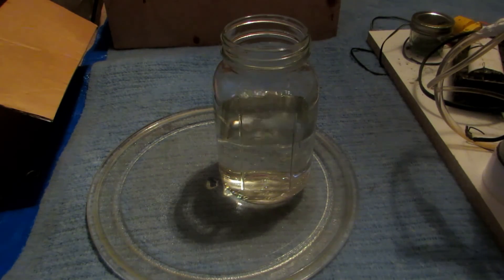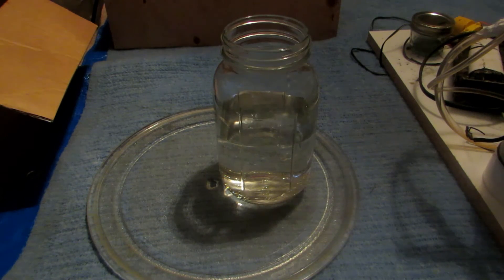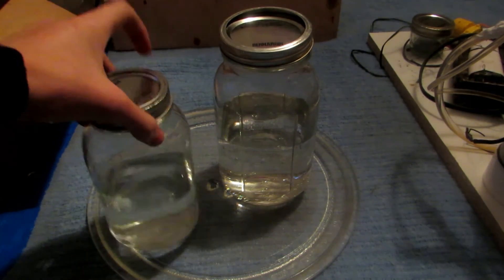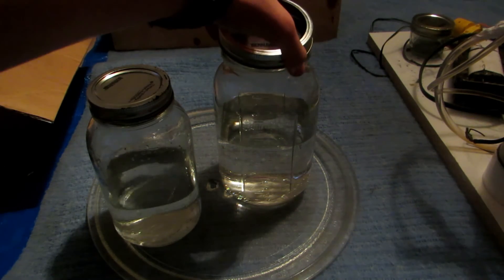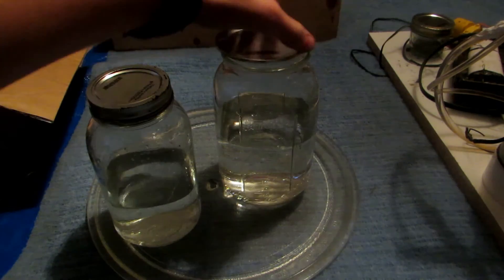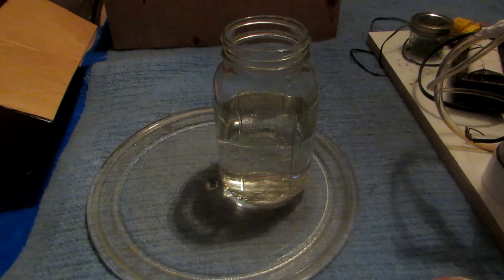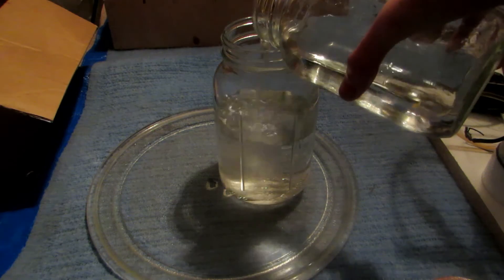It appears we have about 800 milliliters, so I'm going to add about 400 milliliters of distilled water to that 800 milliliters of dichloromethane and methanol. Methanol will go into the water layer, while dichloromethane is not miscible with water at all, so the two layers will separate. Dichloromethane is much heavier, so it will sink to the bottom.